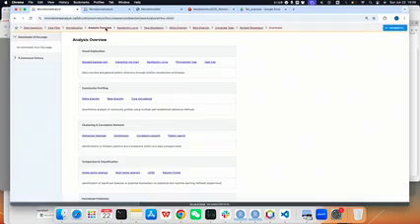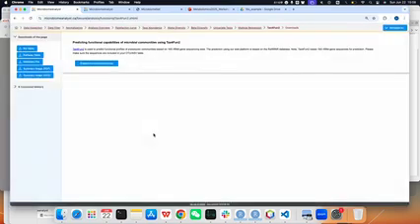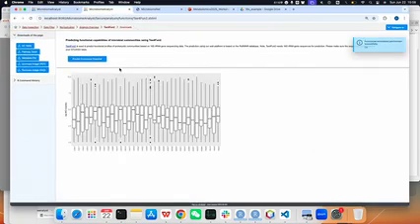I'm running out of time, so just the last one. For the function prediction, before we were just looking at the compositional information, so we have the functional prediction part, predicting the functional capacities. Here's the result, because it takes some time. You can get the KOs from the sequencing data. So this should be all the information for this section.